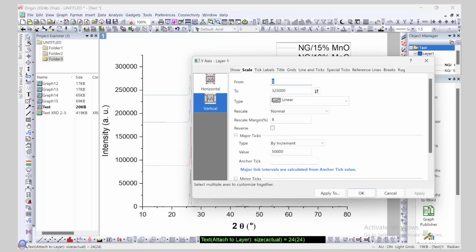And the first graph is on the line because I just wanted to raise it above. So I'll give 1000 so that this goes a little up from the lower graph, which you could see. I think I have to give minus 1000. Yes, so this has come up, you could see here. Previously, it was on the axis. Now I want it a little raised above the axis so that it is easily visible. Also give 5.